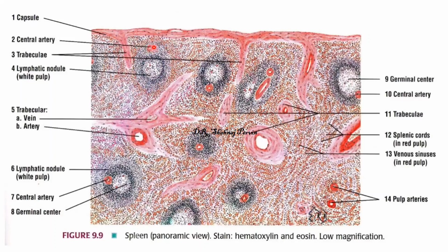White pulp contains what? White pulp contains the central arteriole placed in an eccentric position, and the lymphatic nodule around it. It contains B lymphocytes, and this is the central arteriole you are seeing here. Around the central arteriole is the periarterial lymphatic sheath.